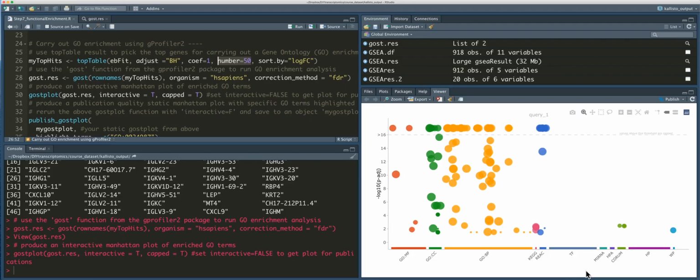We can take any given gene, annotate it with predicted Pfam domains, and then ask, in the set of genes I pulled out, do I see certain Pfam domains, like DNA binding domains, overrepresented? So that kind of generic approach is really powerful, really flexible, and easy to generalize. So that's why we have additional categories down here: KEGG pathways, Reactome, transcription factors, microRNAs, I don't know what HPA or CORUM are, and additional information here.